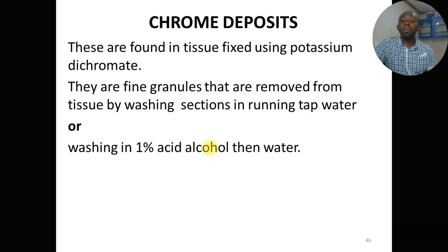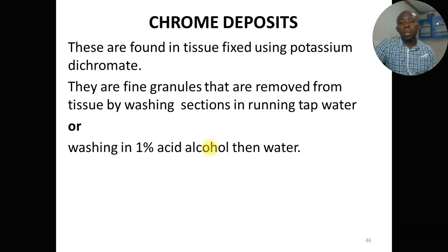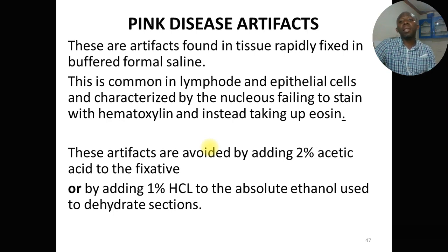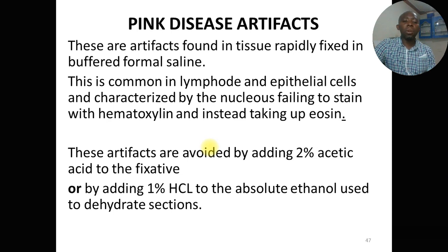Chrome deposits are formed by oxidizing fixatives like potassium permanganate and are found in tissue fixed with potassium dichromate. They are fine granules removed by washing sections in running water or in 1% acid alcohol followed by water. Pinkish disease artifacts are found in tissue rapidly fixed in buffered formosaline, common in lymph nodes and epithelial cells, characterized by the nucleus failing to stain with hematoxylin and instead taking up eosin — the reverse of normal. These artifacts are avoided by adding 2% acetic acid to the fixative or 1% hydrochloric acid to absolute ethanol used to dehydrate sections.